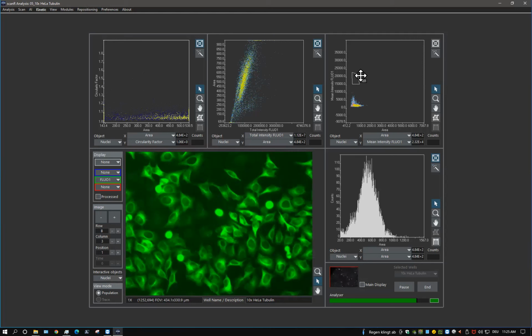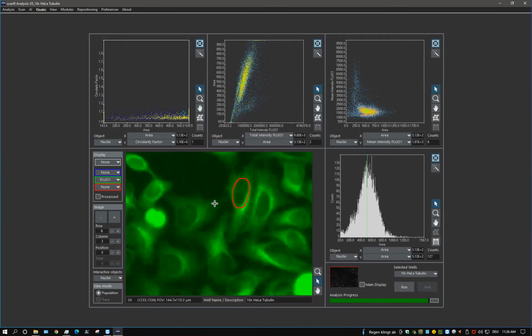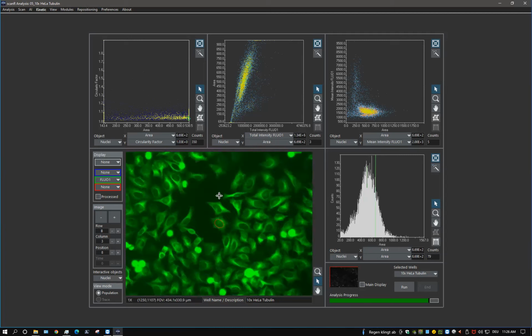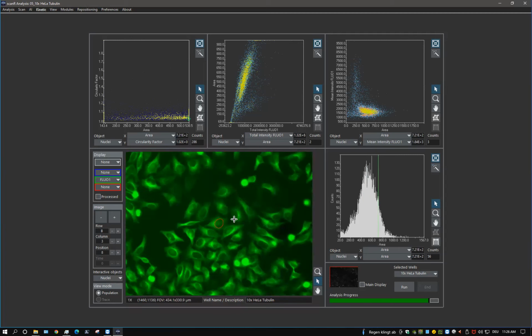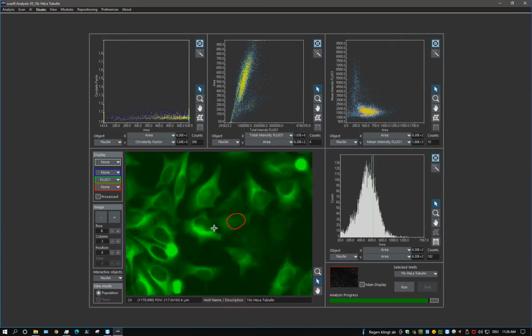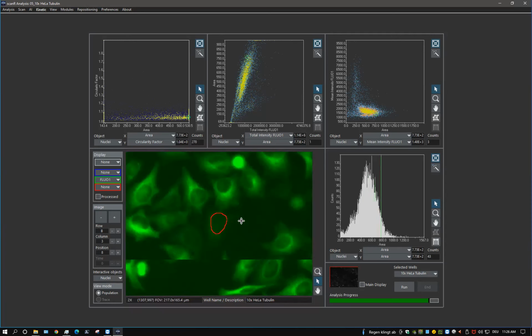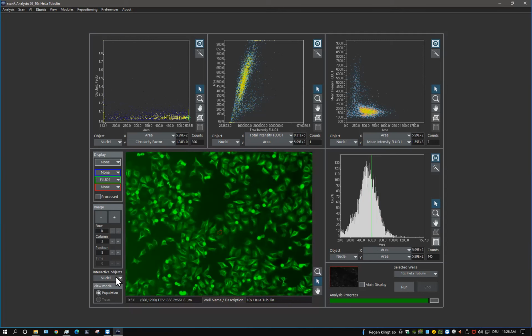But what I do here, I just use the standard assay with the standard pre-trained network for cell detection. And what I see here, it does a decent job, even though this is not a nucleus channel. So it will find almost all the nuclei. It's not perfect. There are errors, definitely. So this is not easy to solve. Like here, for example, for a human, it would also be quite challenging to find the nuclei correctly. But the pre-trained network does a very good job.